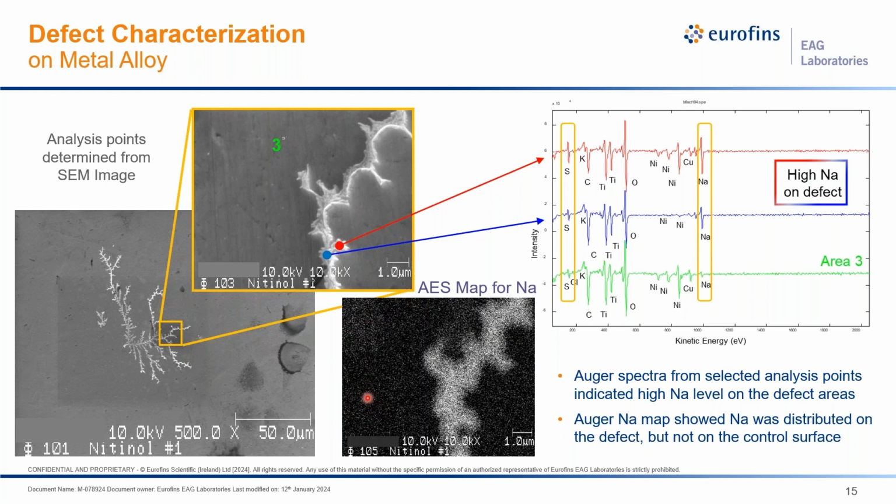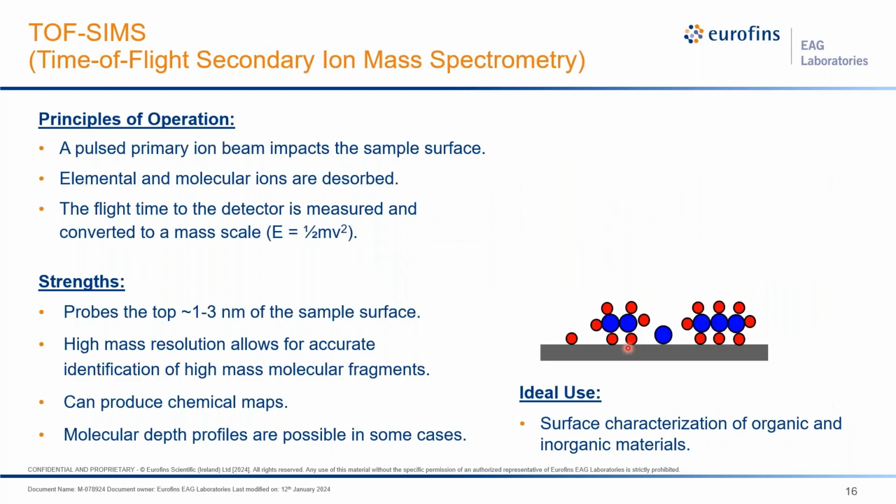Auger will give wonderful elemental information, but it does not give the same kind of bonding information as XPS. It will not differentiate an oxide from a metallic form, and it's not very good for analyzing organic species. It will detect carbon, but not the compound carbon came from. So for the combination of organic functionality, organic identification, and small spot size, time of flight secondary ion mass spectrometry can be an excellent choice.